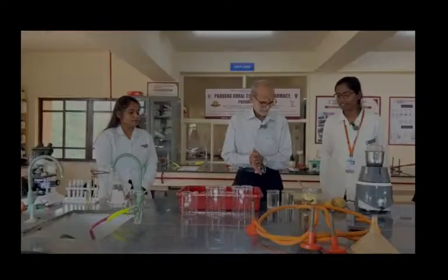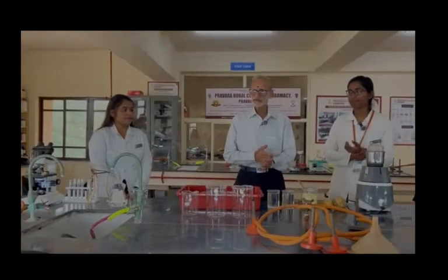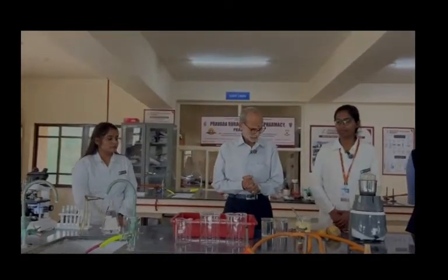It's very easy to isolate. So he has selected phytochemical isolations which are very easy. Another one is quinine from cinchona. We are going to begin with the very first experiment, that is separation of starch from potato.